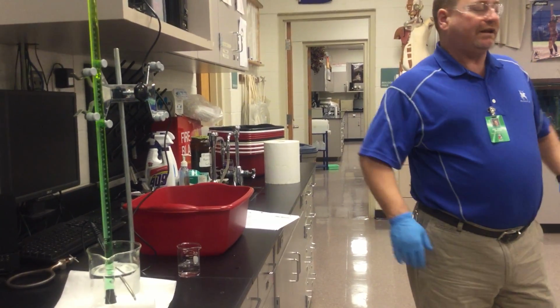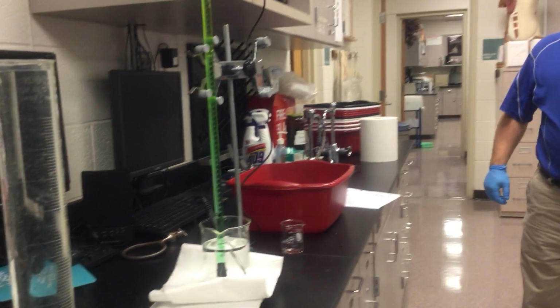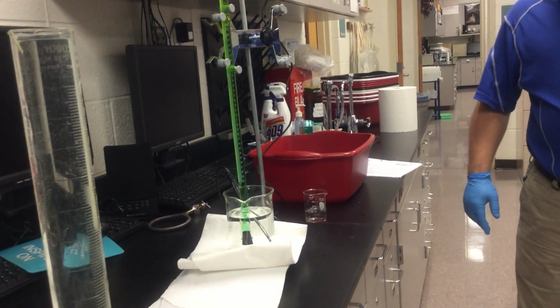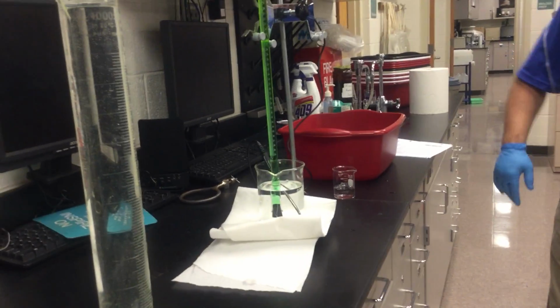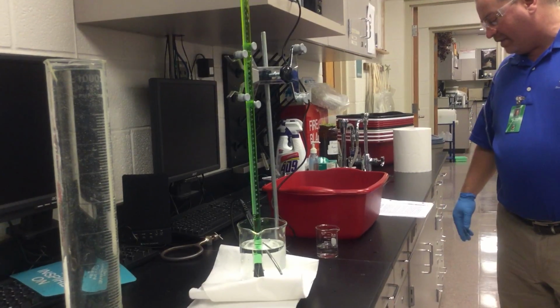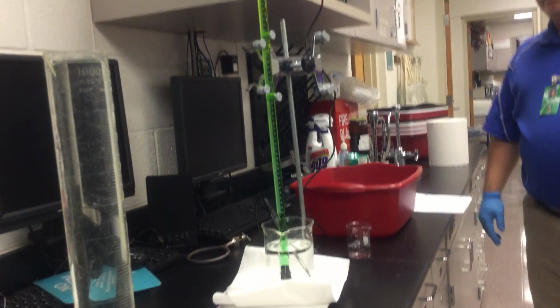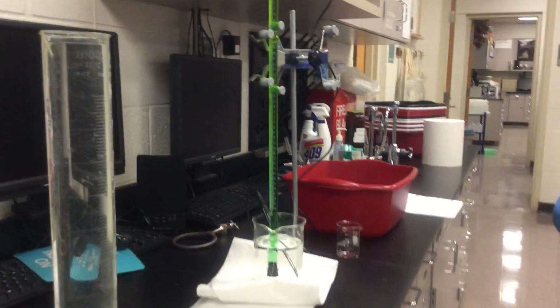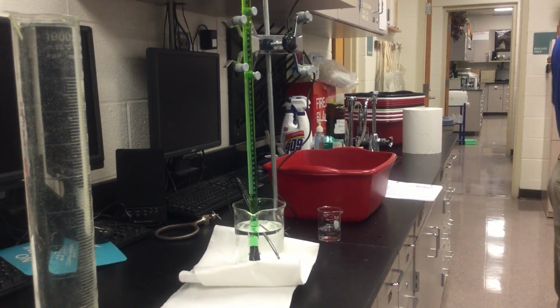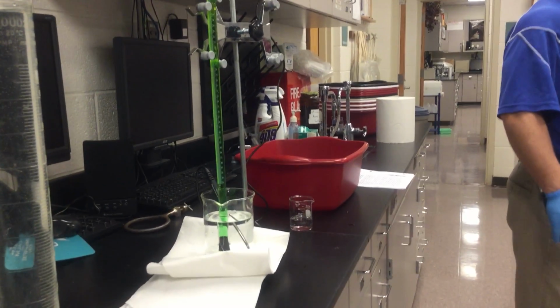What should be happening here in a fairly short amount of time is that magnesium is going to start bubbling. I can see a couple little bubbles there. Okay. So the magnesium will start bubbling, and we are going to sit here and just wait until the reaction is finished. Now, how am I going to know that the reaction is finished? No more bubbling. Okay? No more bubbling.